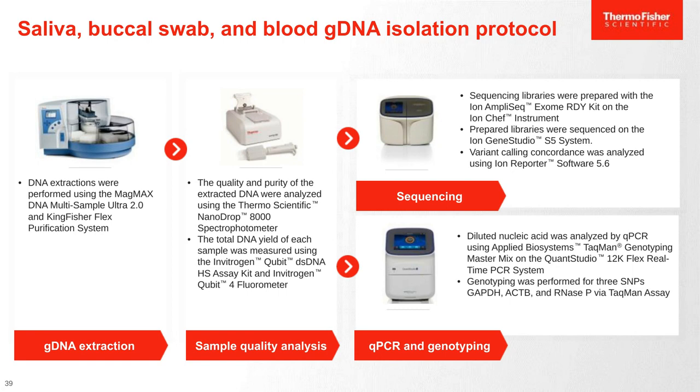We looked at sequencing using the AmpliSeq exome kit, and then we also looked at real-time PCR with several of the TaqMan genotyping assays. And so we performed this for all donors, and then for all of the sample types for each donor.